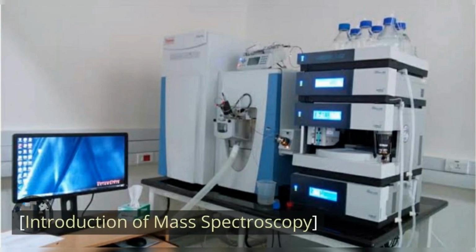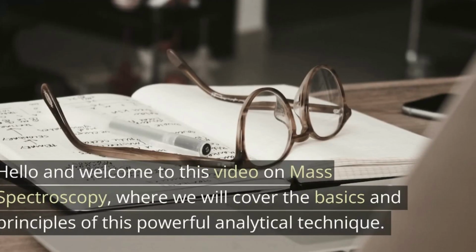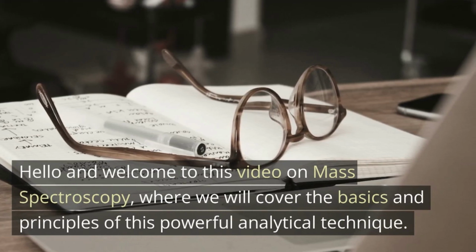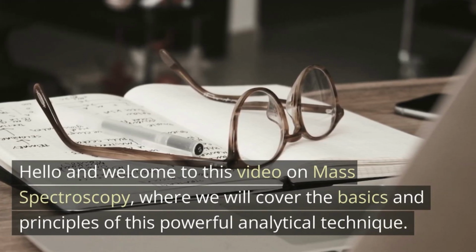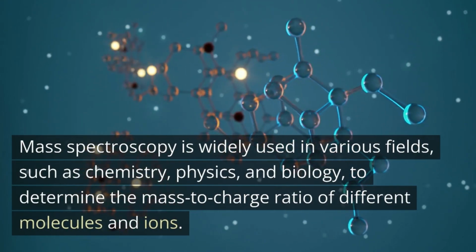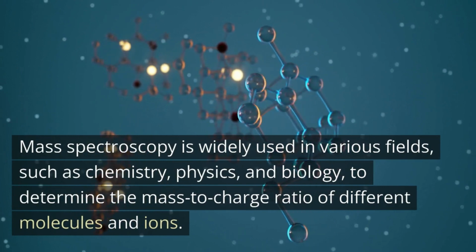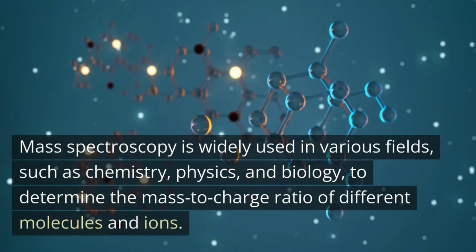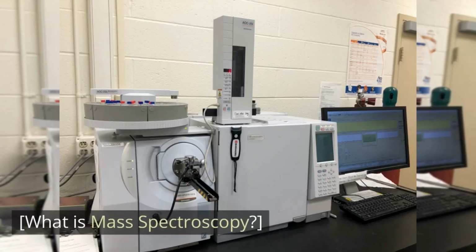Introduction of mass spectroscopy. Hello and welcome to this video on mass spectroscopy, where we will cover the basics and principles of this powerful analytical technique. Mass spectroscopy is widely used in various fields, such as chemistry, physics, and biology, to determine the mass-to-charge ratio of different molecules and ions. What is mass spectroscopy?